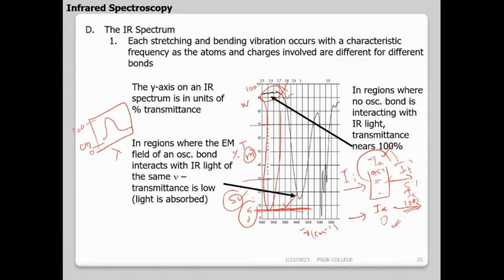In IR, our benefit is being low. I take a strong peak when I have a low value, and a medium peak when I have a high value. So transmittance should be low. Is my voice audible, guys? Any disturbance? Okay. So peaks from 0 to 30 are strong, 30 to 70 medium, and 70 to 100 weak.